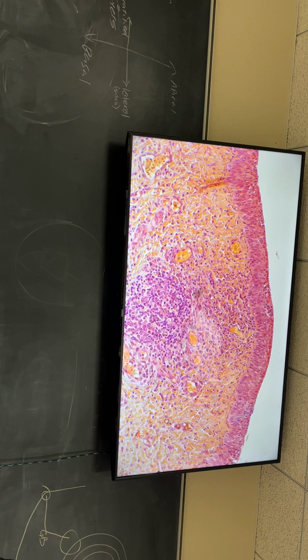Is it a Peyer's patch? Well, it's not a Peyer's patch. Say that louder. Peyer's patch. It's a lymphatic. No, that does make sense. Interesting. Lymphatic. Yep, that's what it is. Lots of blood vessels in there, of course, right?